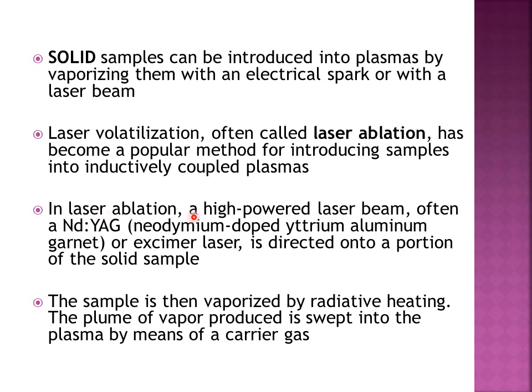In laser ablation, a high-powered laser beam, often Nd:YAG, which is pronounced neodymium-doped yttrium aluminium garnet, or an excimer laser, which is a UV-based laser, is used. These lasers are directed onto a portion of the solid sample. In this way, the sample is vaporized by radiative heating from the laser, and the plume of vapors produced is swept into the plasma by some carrier gas, which may be air.